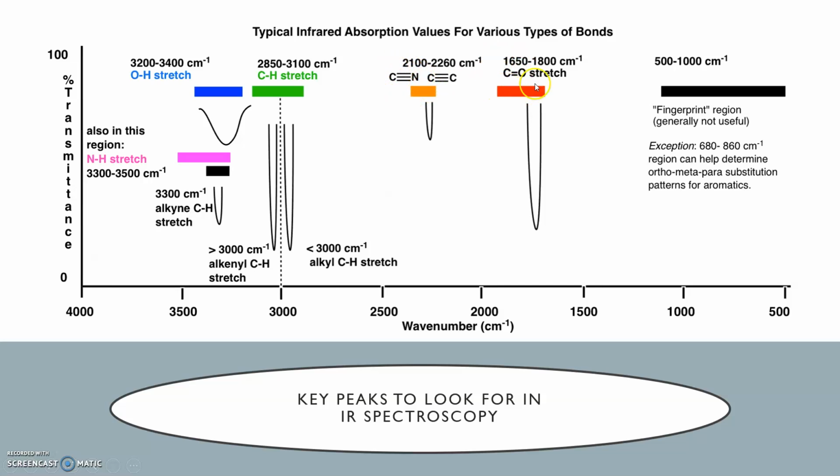I just wanted to point out, though, that you see here that this bond over here is a triple while this is a double. Therefore, it is vibrating at a higher frequency. This may be a single bond, but it is a hydrogen bond, which is a very light atom, versus a nitrogen or a carbon or an oxygen, and therefore it is vibrating at a higher frequency.